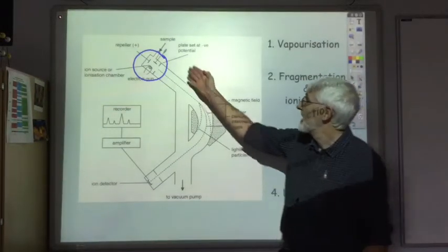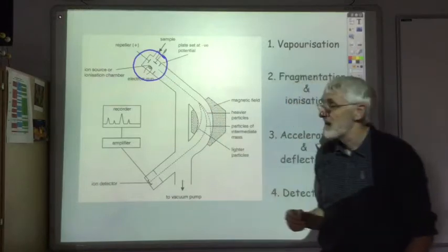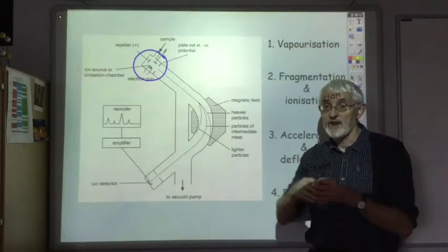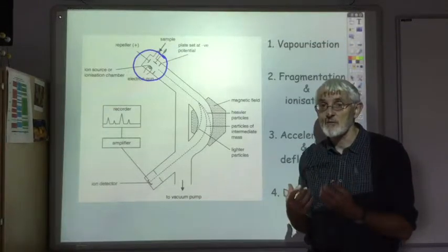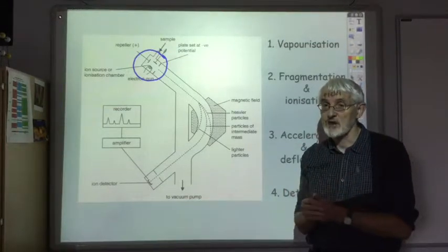So in the second step, the vaporized sample gets fragmented, and those fragments have electrons removed, so they have a single positive charge.